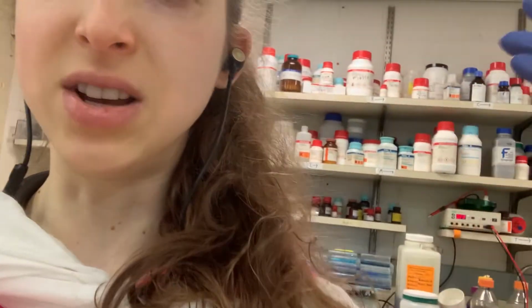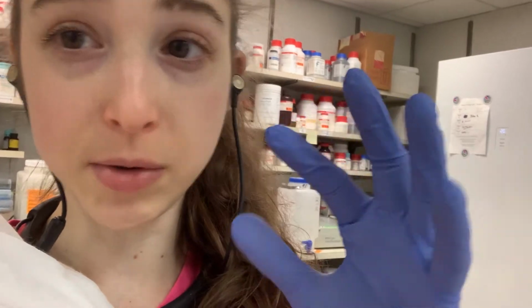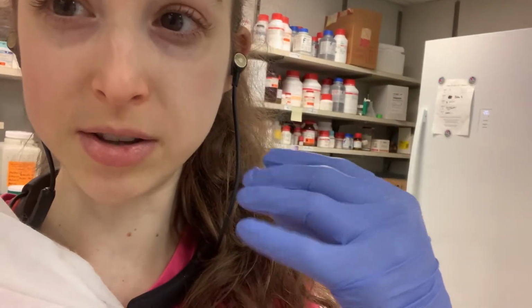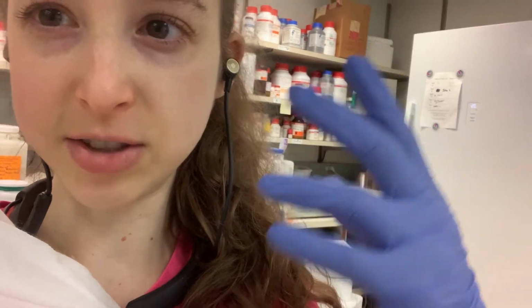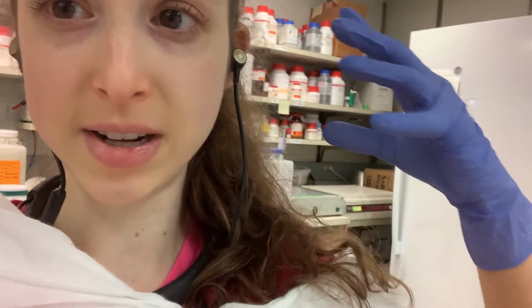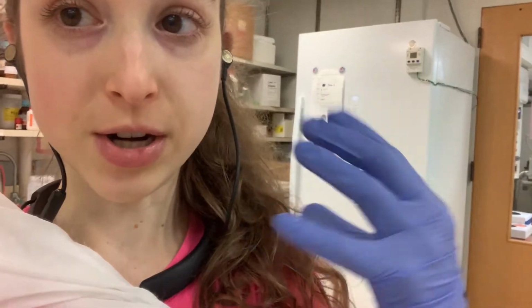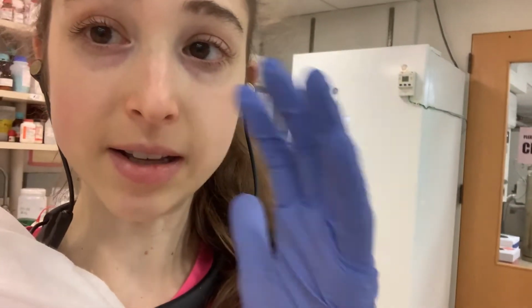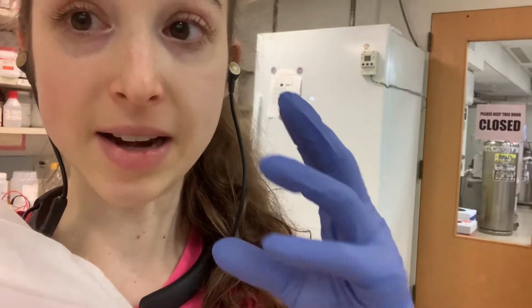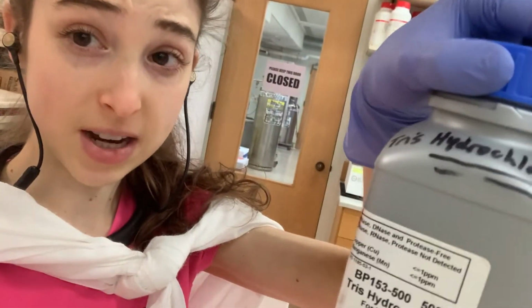You don't have to wait until it's fully dissolved. For some buffers, you want to watch, because sometimes they won't dissolve until the pH is acidic or basic enough, so you might need to add some base or some acid to get it to dissolve. You can do the buffer preparation in different ways. You can start with the base form and the acid form. With Tris, you have Tris base and Tris HCl, Tris hydrochloride. This is the acid form and this is the base form.